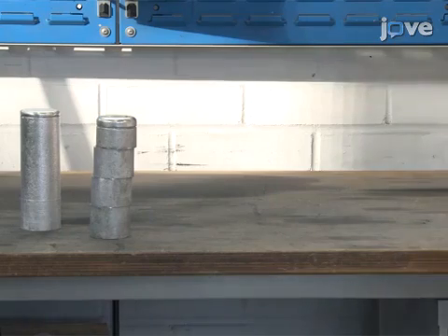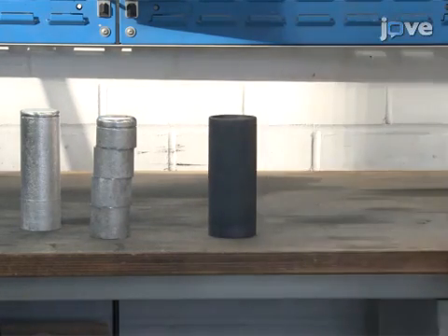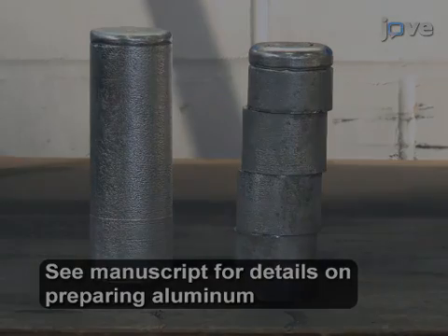Prior to this experiment, a commercial purity aluminum ingot has been cast for use in the mold. The aluminum is formed into a cylindrical bar with a 50 millimeter diameter.